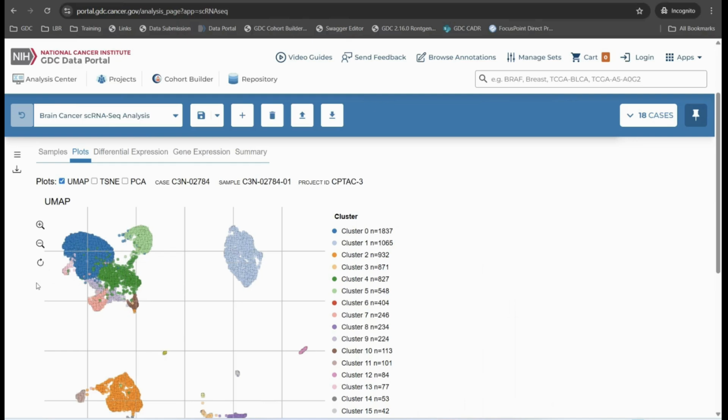Hide show cluster controls. Clicking on a specific cluster within the cluster legend on the right side of the plot presents options to hide or show specific clusters. By default, all clusters are shown. When selecting to hide a cluster, the cluster is crossed out with a line. By reselecting the hidden cluster, it is made visible.